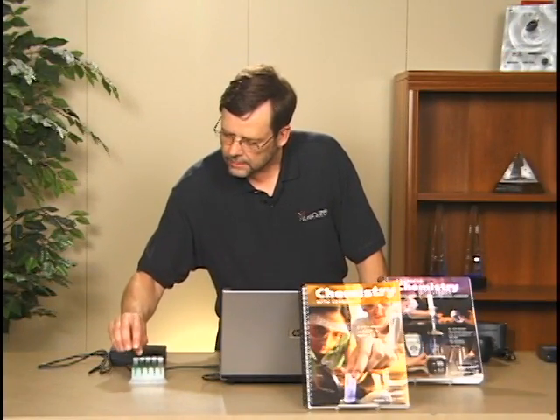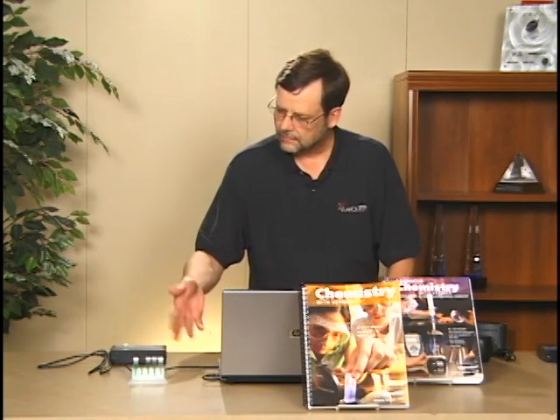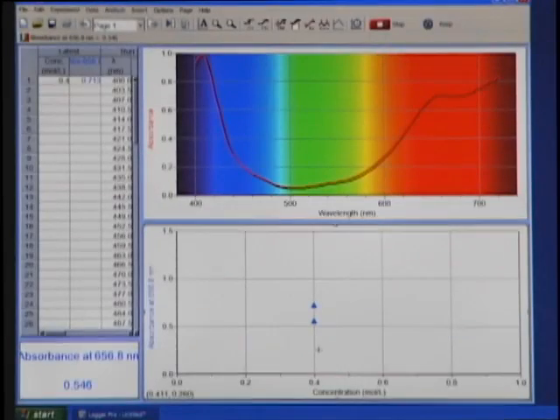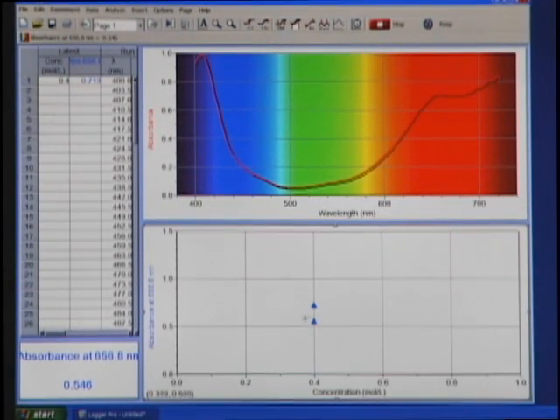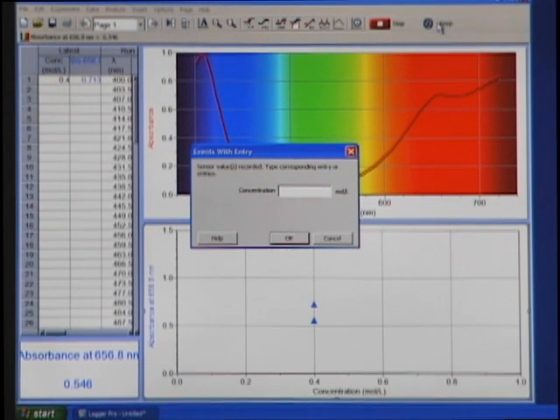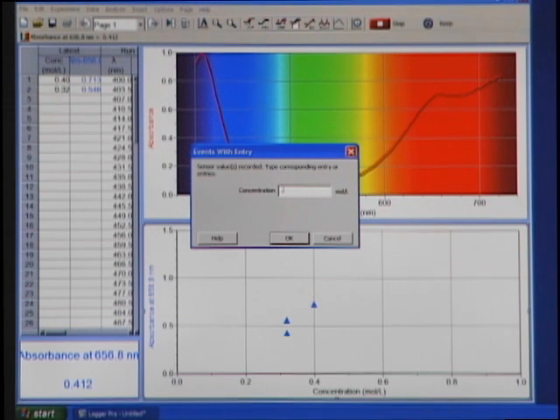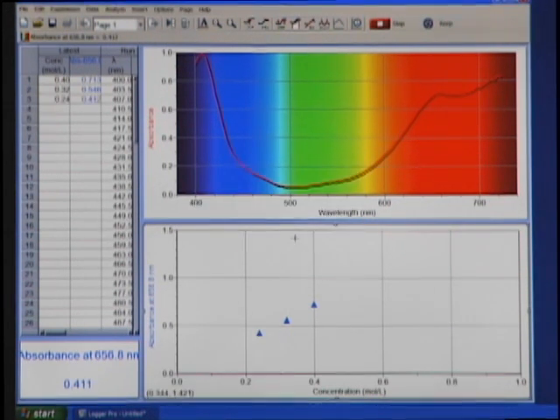Now I'm going to go right down the line. I'm going to go ahead and put in the 0.32 molar solution. Even visibly, it might even look a little bit lighter to you. Notice that its value, there's a live cursor here, is a little bit lower. And it's down at 0.546. I'm going to click on Keep. And I'm going to enter 0.32 molar. In the same manner, I'm going to place in 0.24 molar nickel sulfate. Click Keep. 0.24. OK.